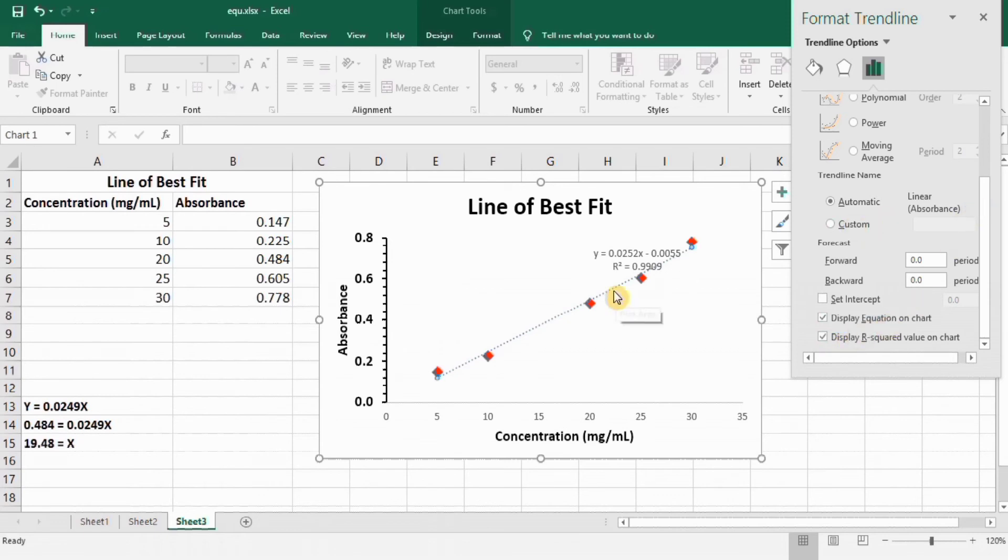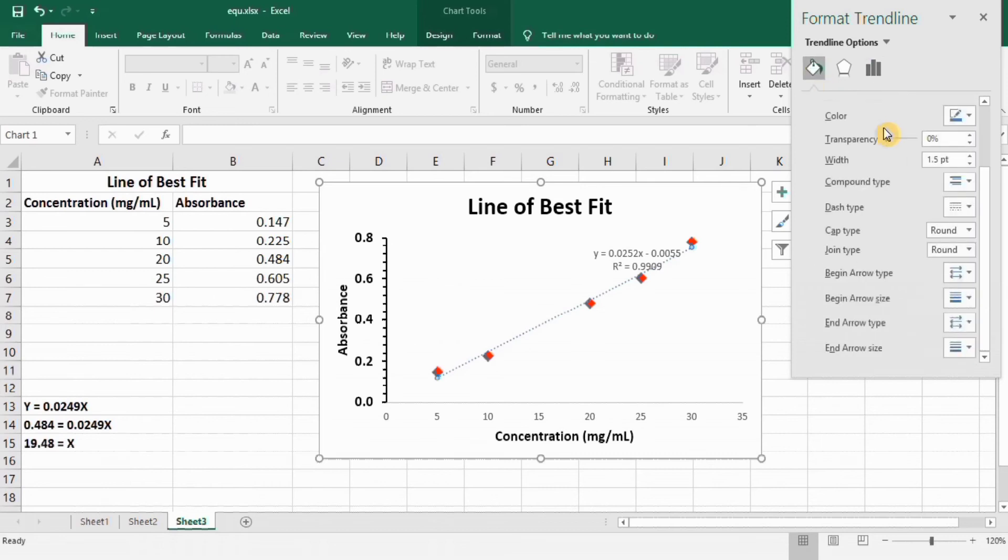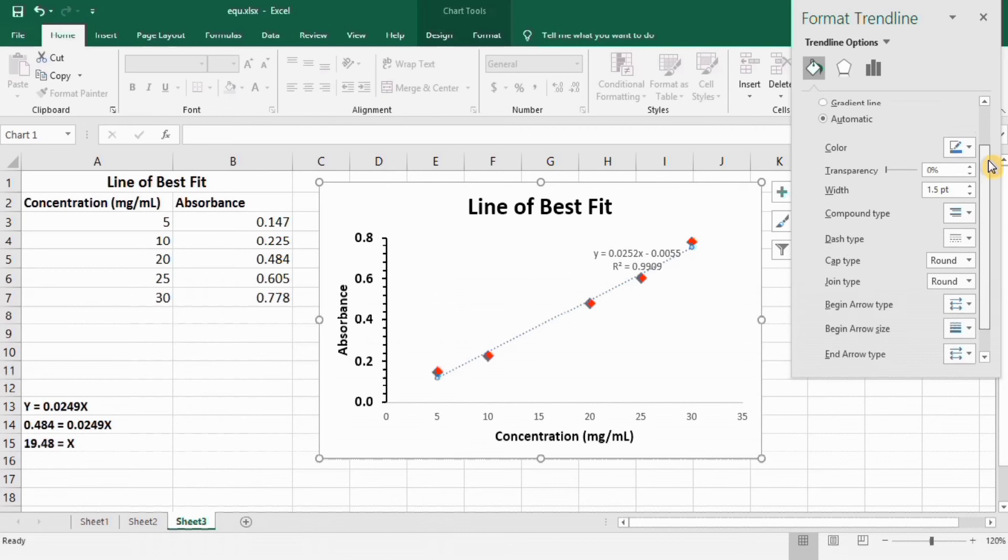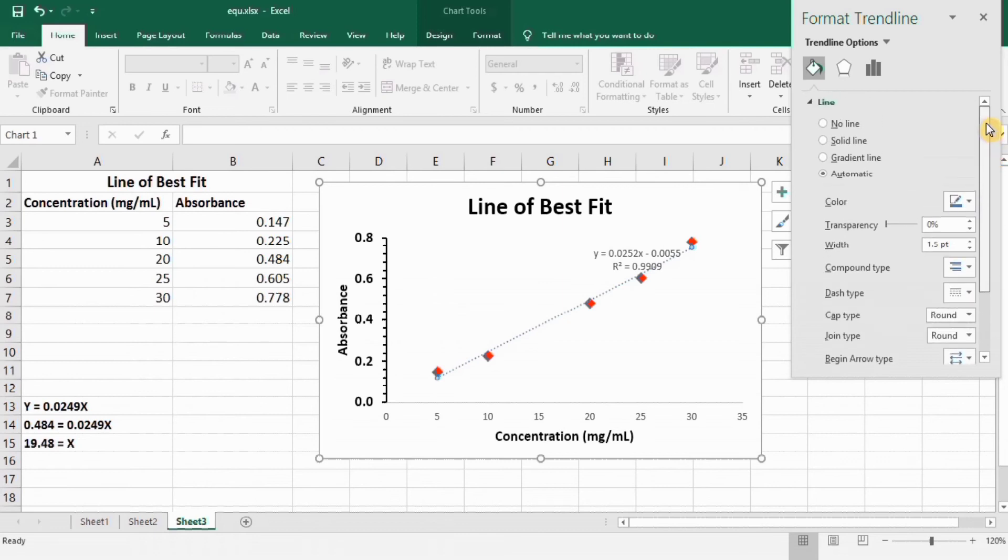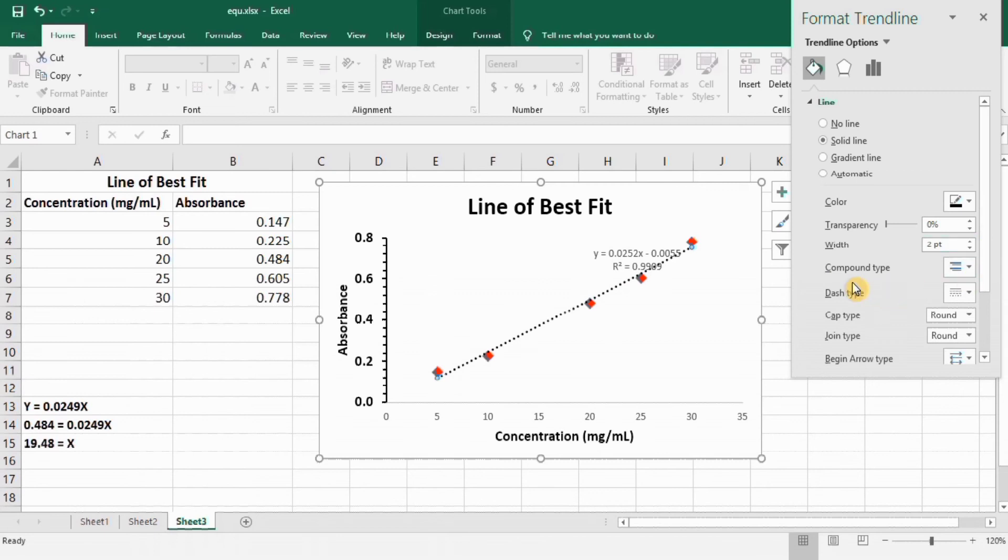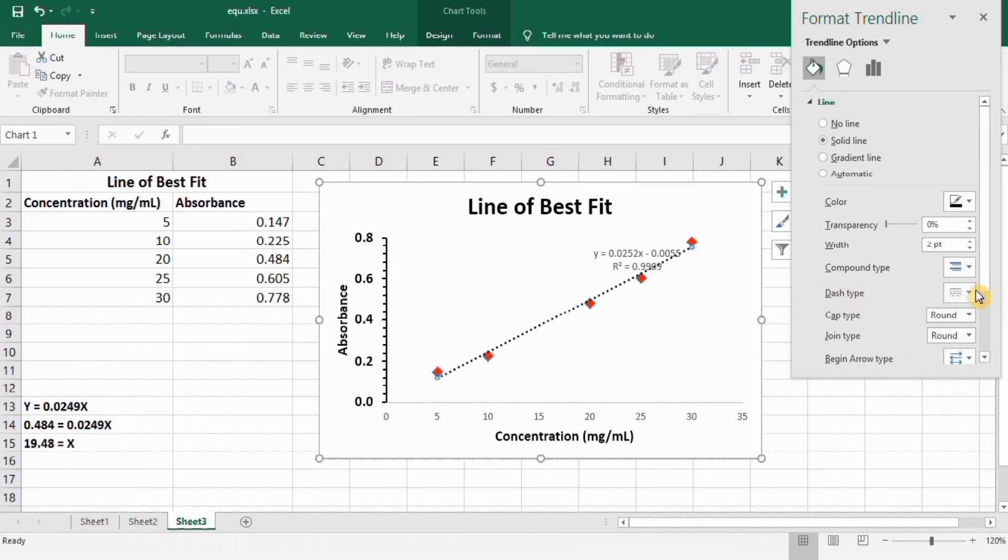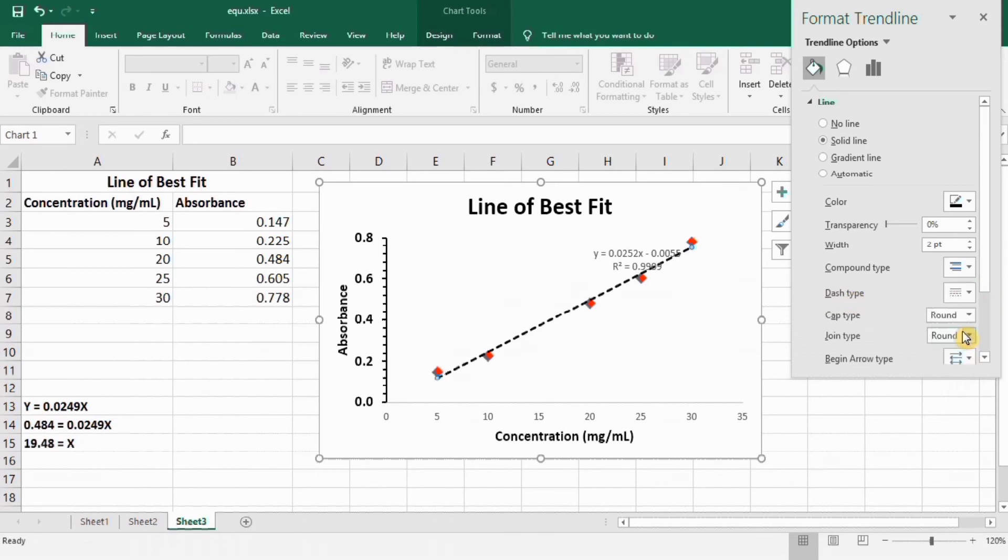Now if you want to change this line, go to fill and line option and you can edit it. For example I want solid line here. You can see here black color is selected. If you change the width, this is the option. If you want compound type, you can see either single line or double line. And in dash type you can change the dotted style. For example I will select this one. You can see here that the dotted option is changed.